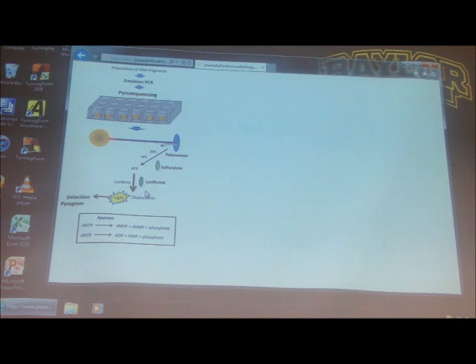And that ATP will power a luciferase reaction. Here's luciferase, which is the enzyme. So luciferase plus the ATP, which has been provided by the pyrophosphate, plus luciferin, which is a substrate, and we get a shot of light, which is then measured.